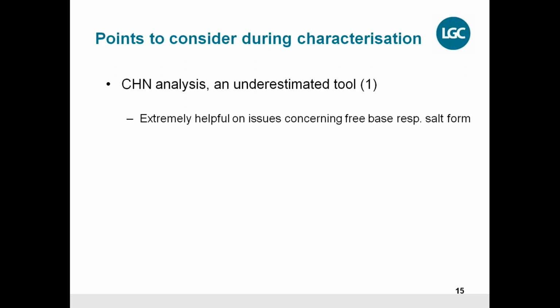I would like to point you now to a few other things that you should consider during characterization of reference standards for impurities, or when you look for suitable suppliers for your purposes. And I would like to say a few words about CHN analysis, which is at times an underestimated tool, because it is extremely helpful on issues concerning the question: do I have a free base in front of me, or do I have a salt form present with my impurity?